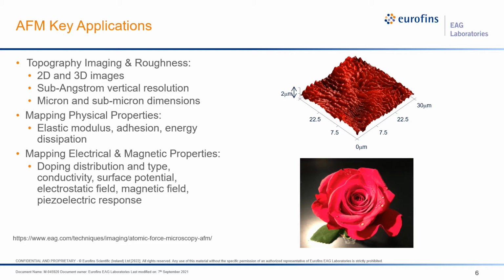Although AFM is most often thought of for its use in topography, it can provide much more. It can map various physical, electrical, and magnetic properties too. We'll get into more details about these advanced modes later in the presentation.